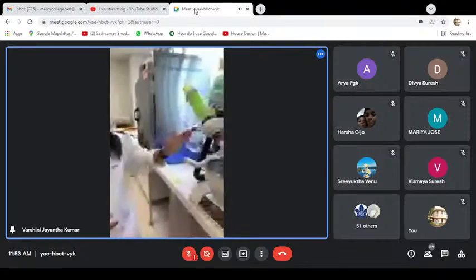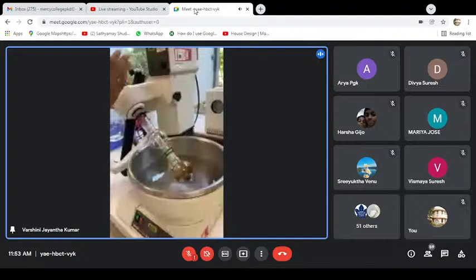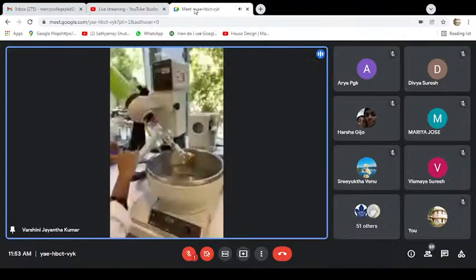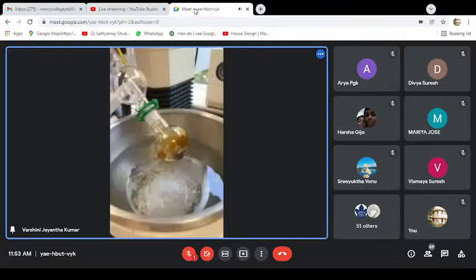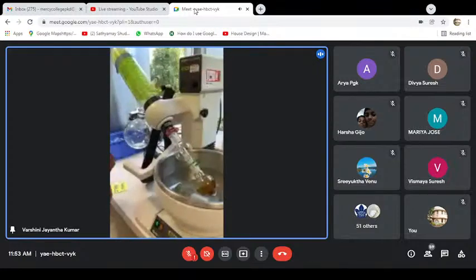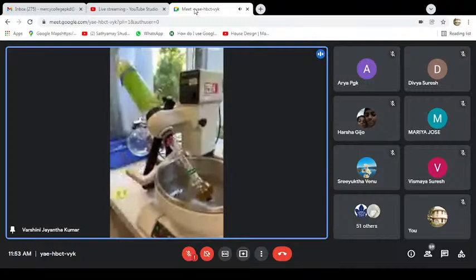So that's why we have this handy machine here. Where we have a water bath, a coolant, and a receiving flask. So what we do is we try to rotate the reaction mixture and the solvents in this round bottom flask, and we keep it on the water bath and we reduce the pressure. So what happens is that as pressure reduces, the boiling point decreases. So if it's hexane in there, the boiling point is 69.